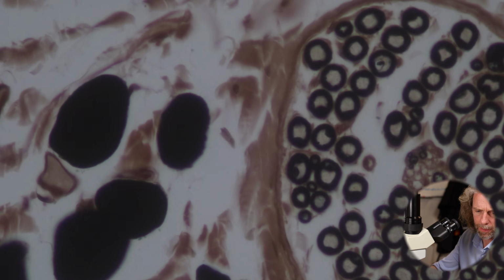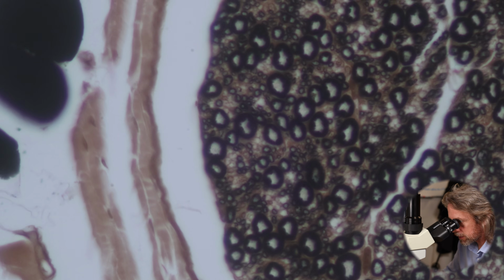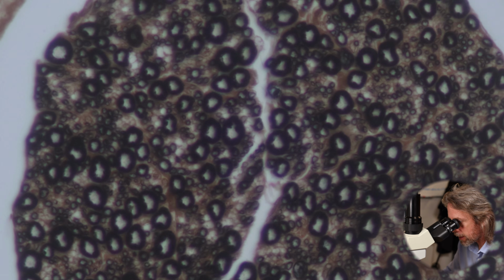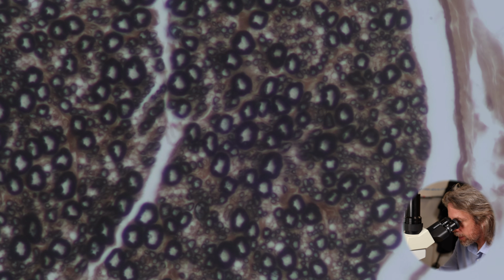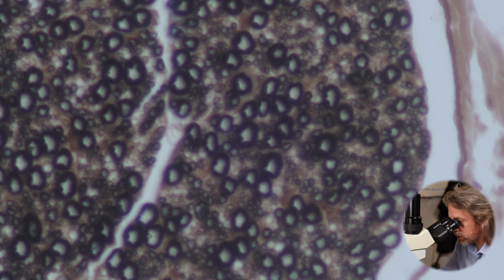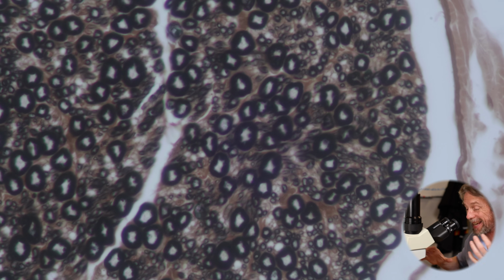Oh my word, and look at that. We're seeing lots of circles of different sizes, almost like these neurons are different and doing slightly different jobs. And that's how a lot of neurons are classified, by their diameter, by how much myelin they have. So the bigger the diameter of a neuron, the faster the action potential will be propagated along it.